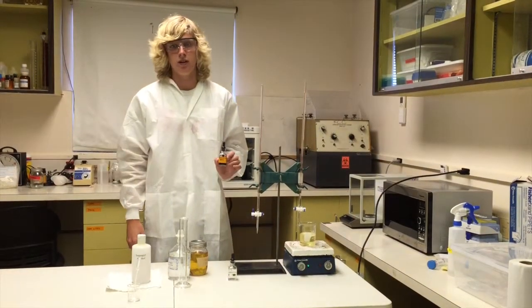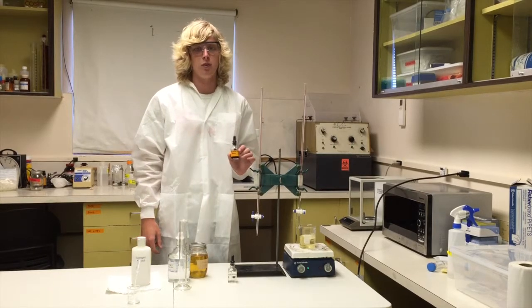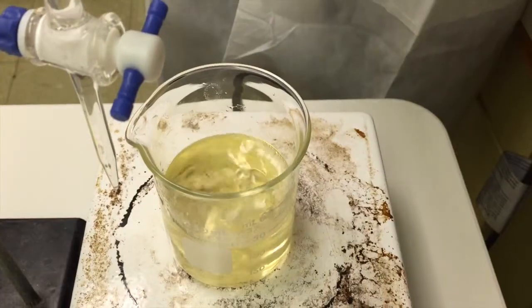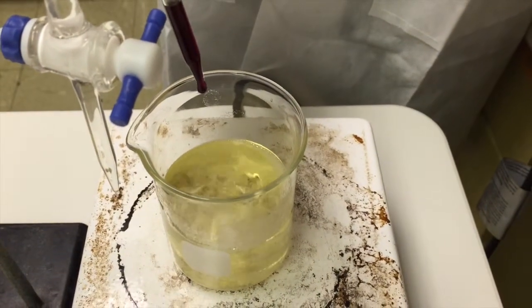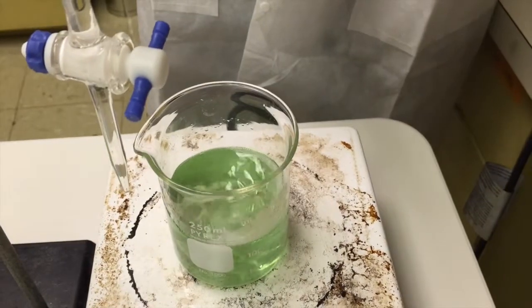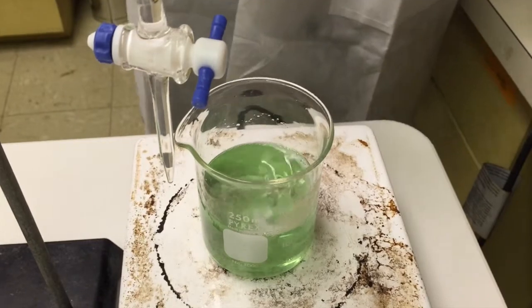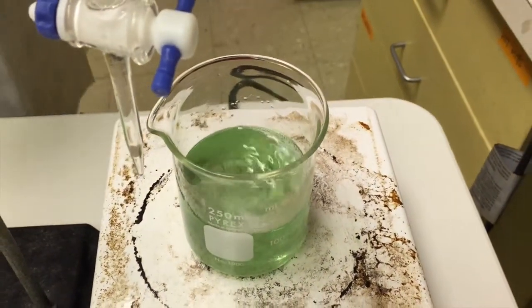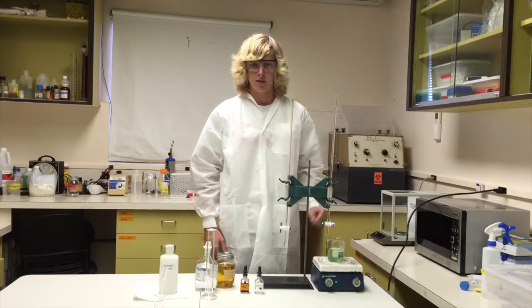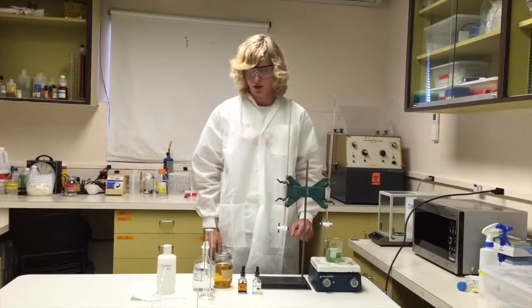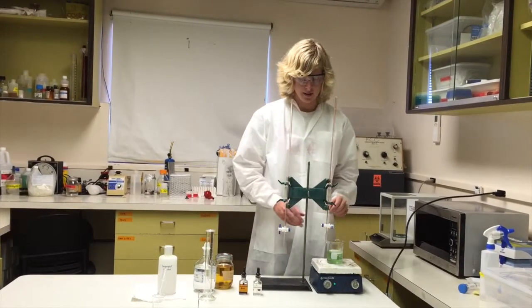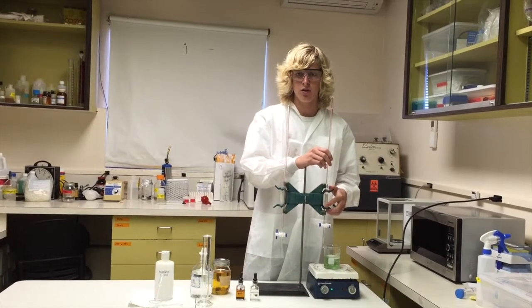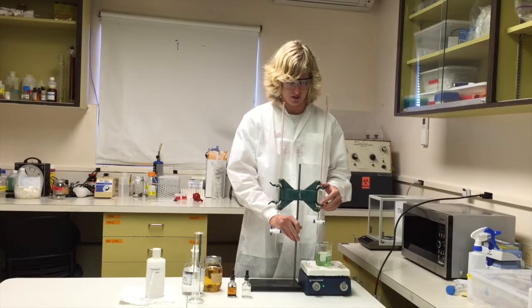The next step is we are going to now add 20 drops of bromothymol blue to our alcohol ester solution. So now, see the color difference after we've added 20 drops? It appears rather greenish. The next step is now we are going to add our hydrochloric acid solution into this until the solution changes color from this bluish green to a bright yellow.